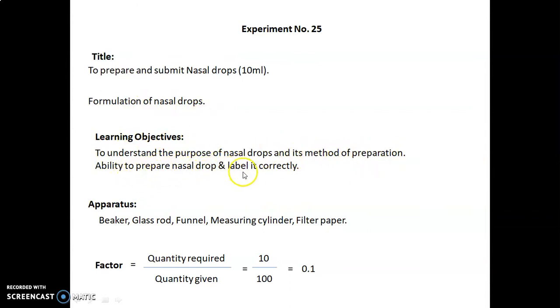Apparatus required are: beaker, glass rod, funnel, measuring cylinder, filter paper. Factor calculated as quantity required upon quantity given, that is equal to 10 upon 100, equals 0.1.